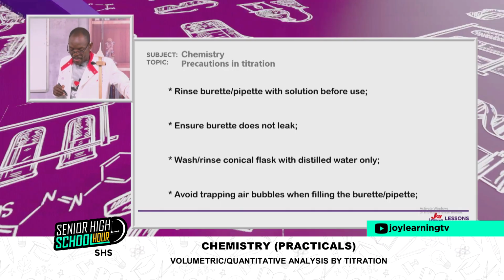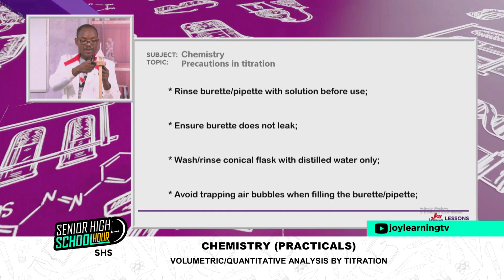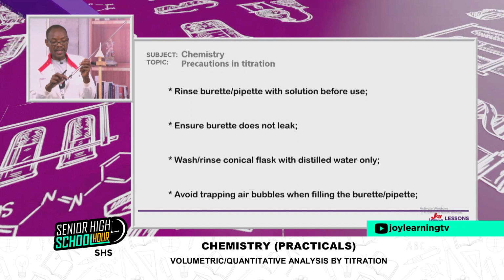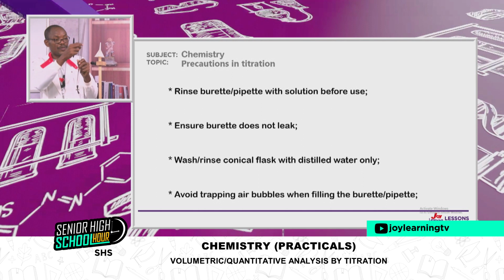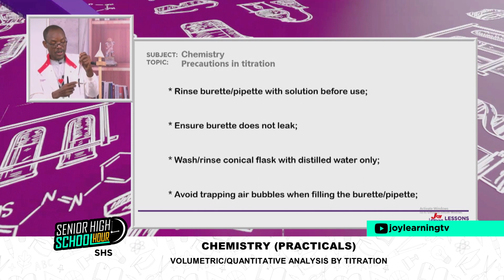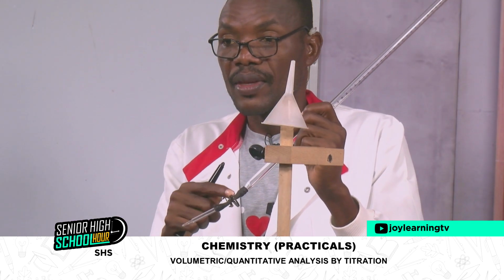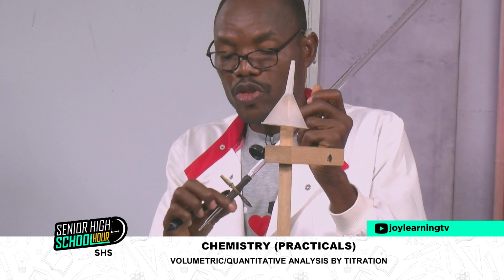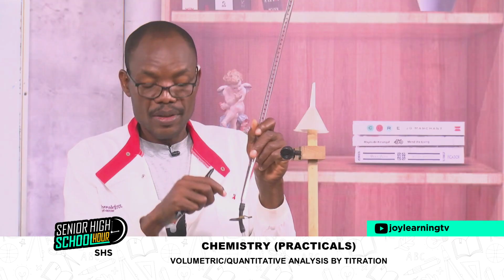Avoid trapping air bubbles when filling the burette or pipette, especially if you are using this type of burette. The rubber tubings here can hold a lot of air inside. So if that is the case, when you are filling the burette, to a point, open and make sure that every air bubble in here is removed. You can decide to massage the rubber tubing to let go of air bubbles. Make sure that the rubber tubing is really containing nothing but the solution in the burette.